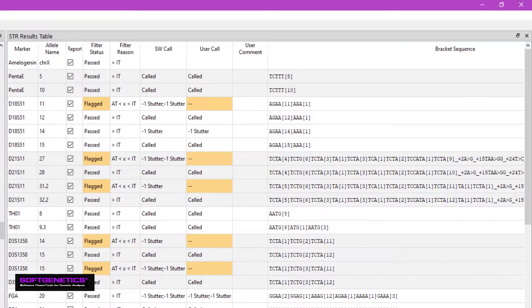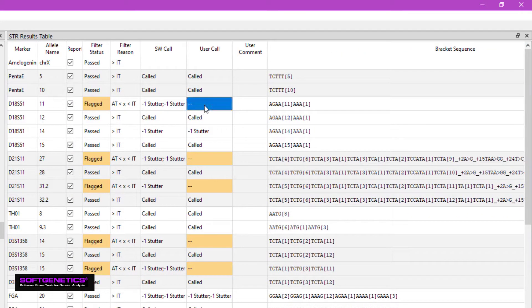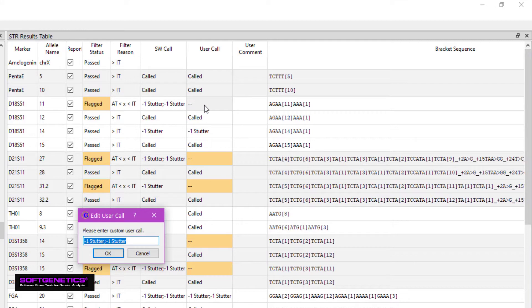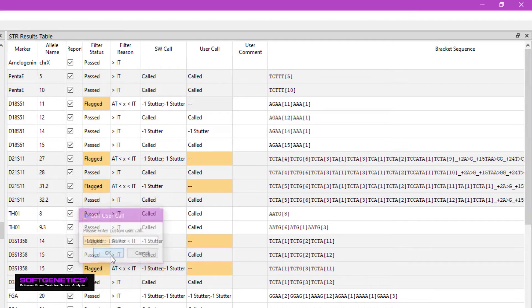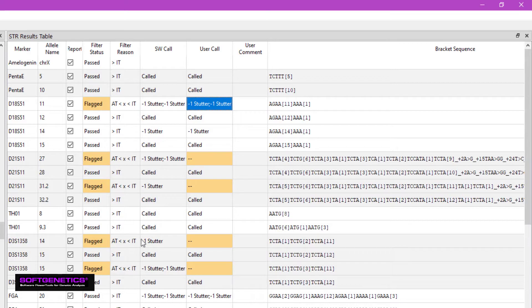Calls that are flagged for review are highlighted in orange. By double-clicking on the user call field, you can enter in the desired call. Edited calls will then be highlighted in green.